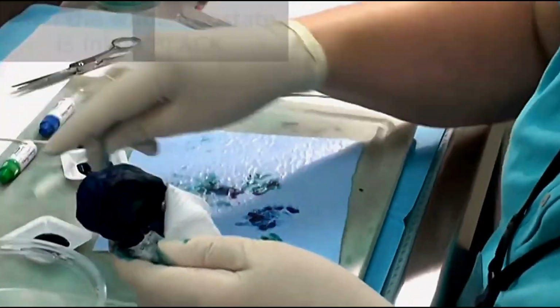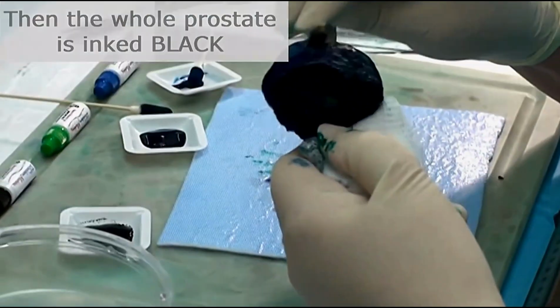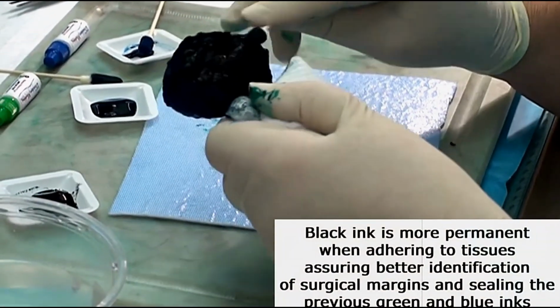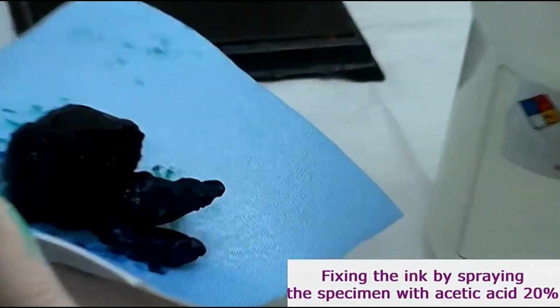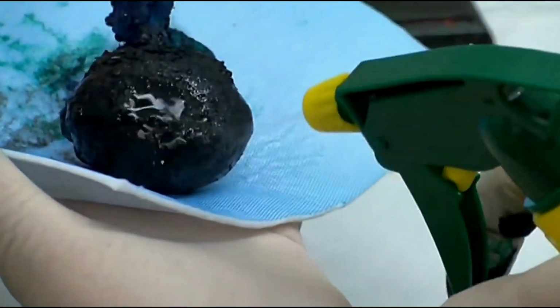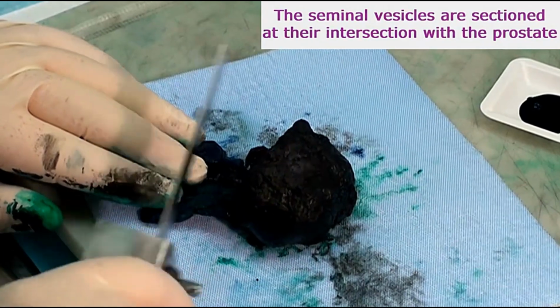But on top of that, because those inks are not really very sticky to tissues afterwards, we ink them completely with black ink, because the black ink is more stable, but still we have the green and the blue underneath. And then we fix it with acetic acid, as you know.